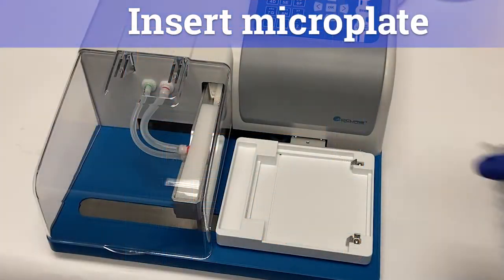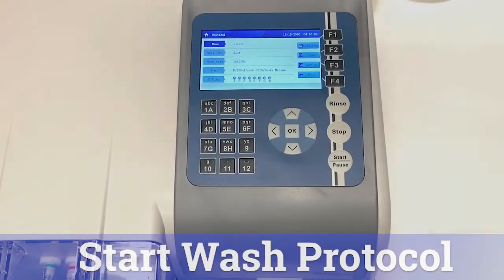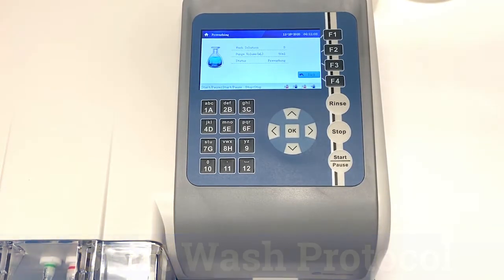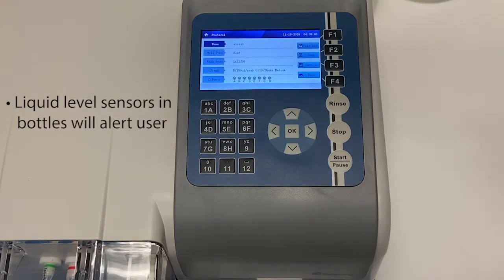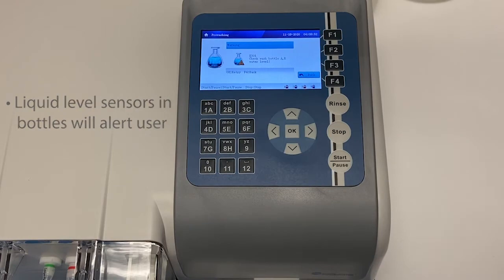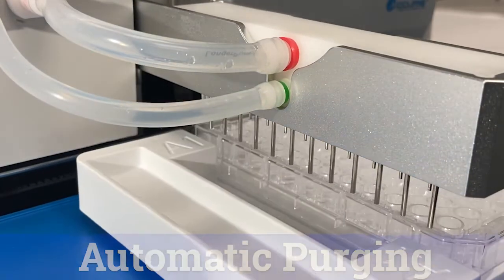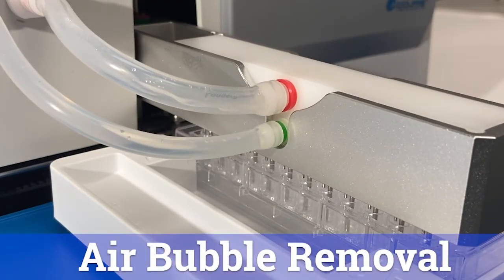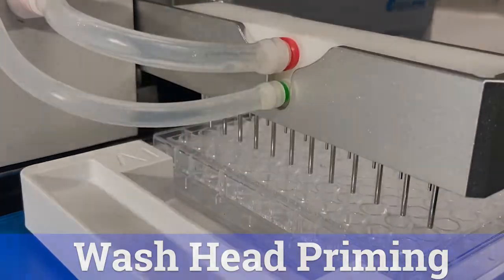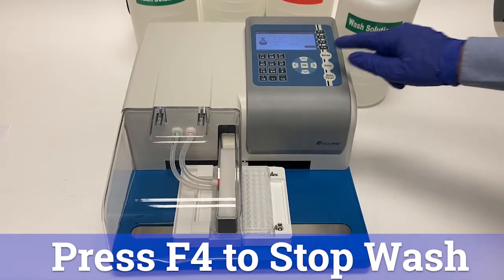In order to run a wash protocol, first place a microplate on the plate holder. Select a protocol from the list and push the start/pause button. Sensors in wash and waste bottles detect levels of liquid and will sound an alert when they need to be filled or emptied. The machine automatically runs a purge cycle at the start of a new run, which serves to remove air bubbles and to fill the dispensing tube and wash heads with the appropriate wash solution. If needed, the wash cycle can be stopped at any time by pressing F4.